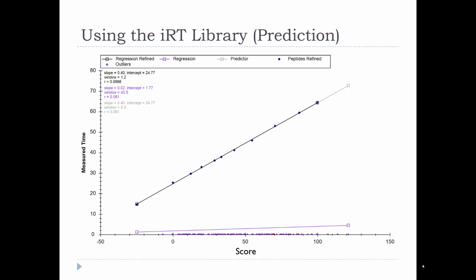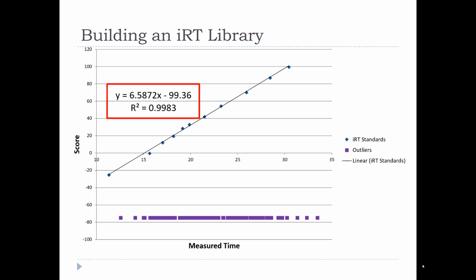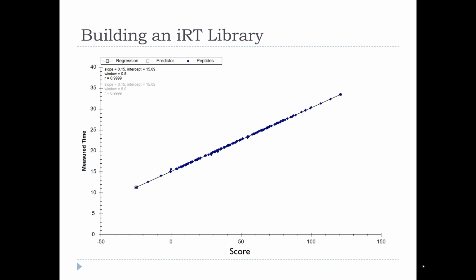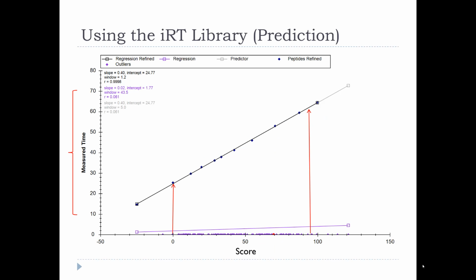Well, it's pretty simple. Again, I measure my IRT peptides. I do a linear regression on those. So these are the steps. So anyway, I measured these.